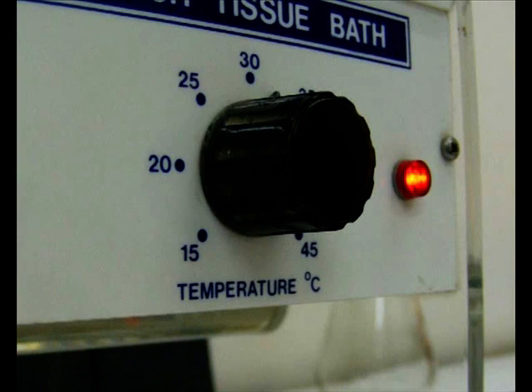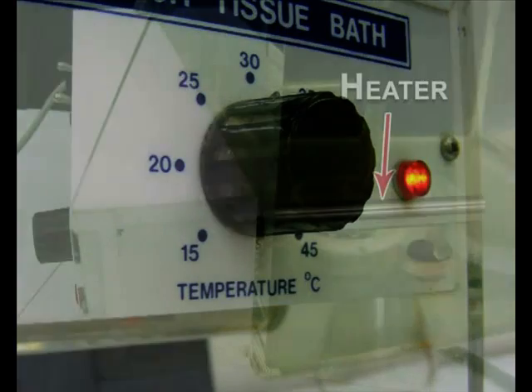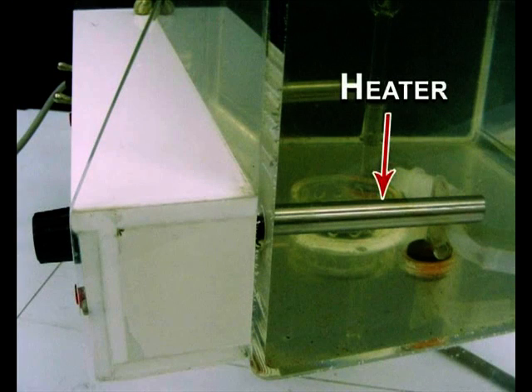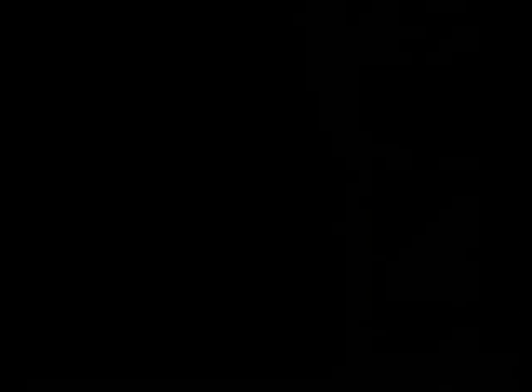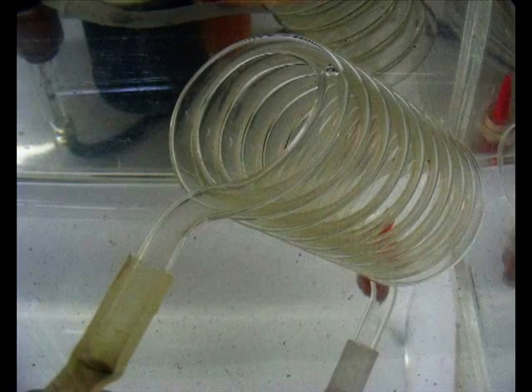The temperature regulator sets the bath at the required temperature. The heater raises the temperature of the water bath to the required temperature. The coil allows the physiological solution to attain the bath temperature as the solution runs through it.